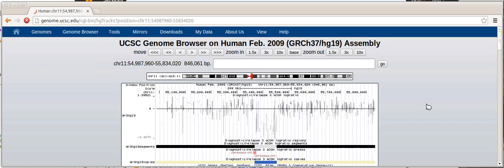Chromosome 11. Yeah, so on chromosome 11 it looks like there's some interesting OR4P4 or 4 other genes, and so you can very clearly see this is the probe log ratio measurement signal, and this is the segmentation model.